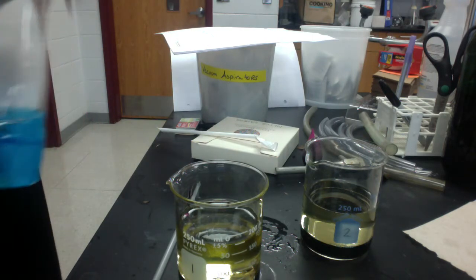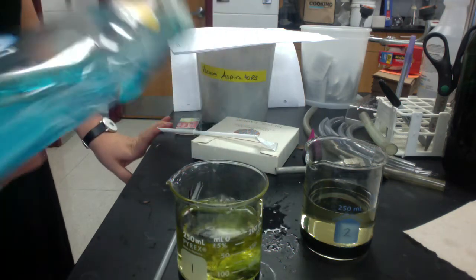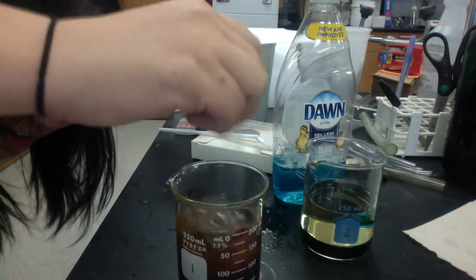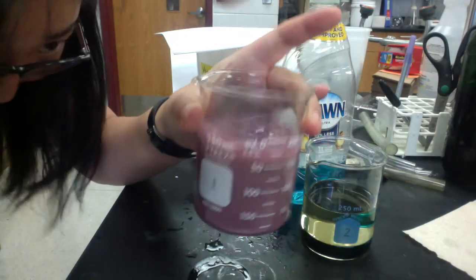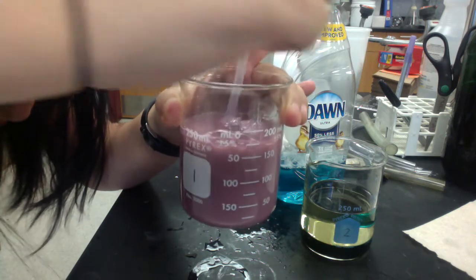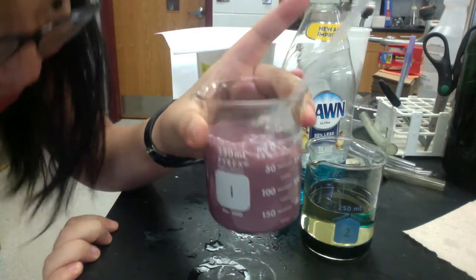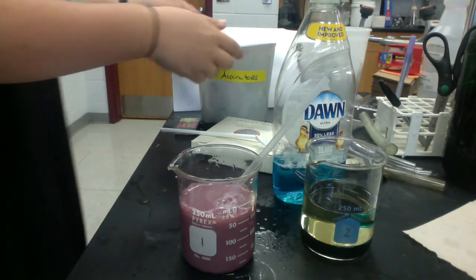It says just beaker 1. So, okay. This is not good soap, but it says to stir vigorously. That was a little bit more liquid than I thought it was going to be. It is what it is. Wow, that looks quite a bit different, right? Record that. What do we see now?